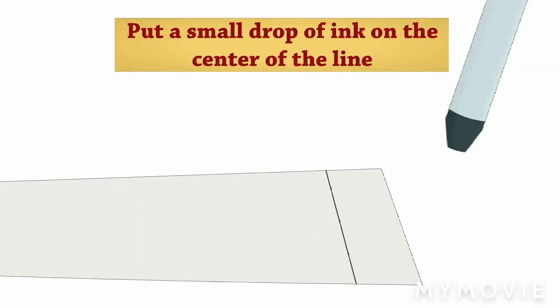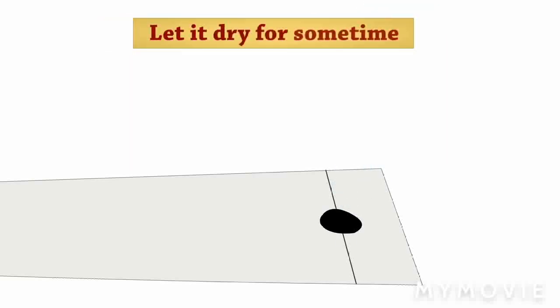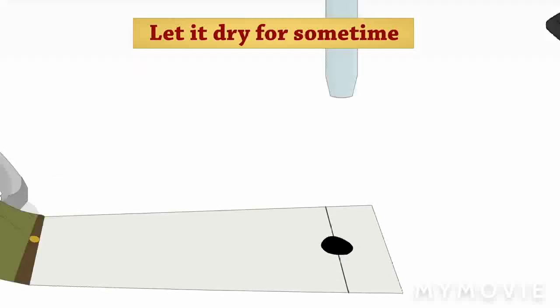Put a small drop of ink on the center of the line. Let it dry for some time.